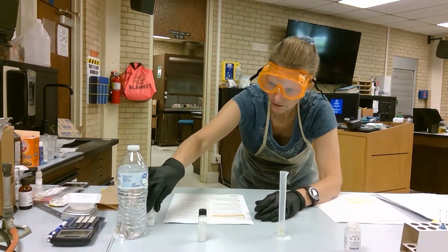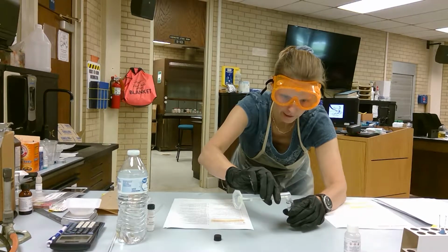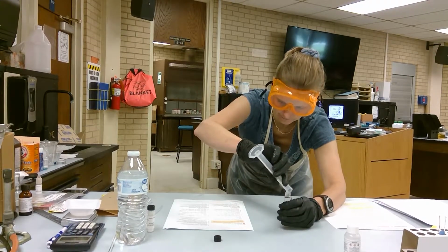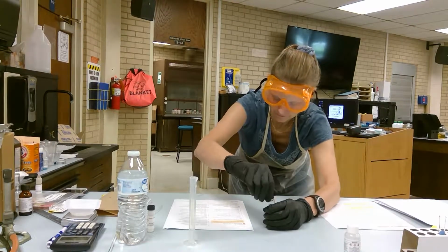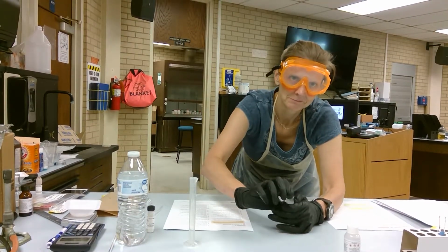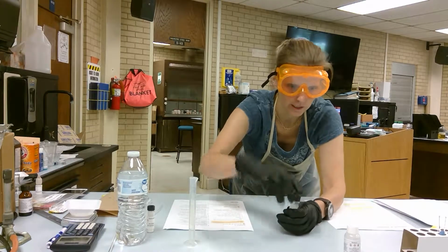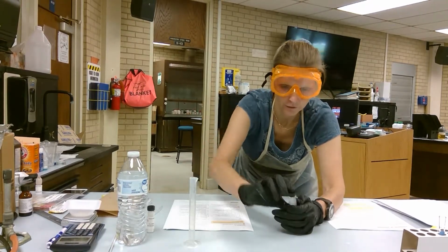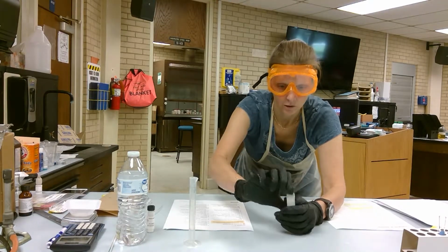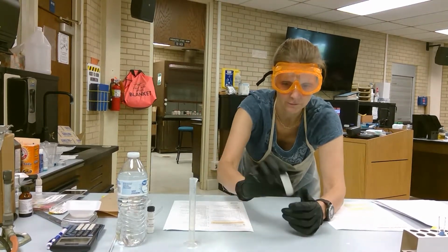All right, set it aside. Now we're going to add my 1 mL directly to my dram. Kind of a funny name to call a glass vial, but okay. Oil and water. We know that one's polar and one's non-polar, which is the point of our calcium hydroxide. Okay, so for the next 48 hours, we'll shake this occasionally and we'll let the process begin. In 48 hours, we'll come back and we'll see whether or not we converted our vegetable oil to biodiesel.